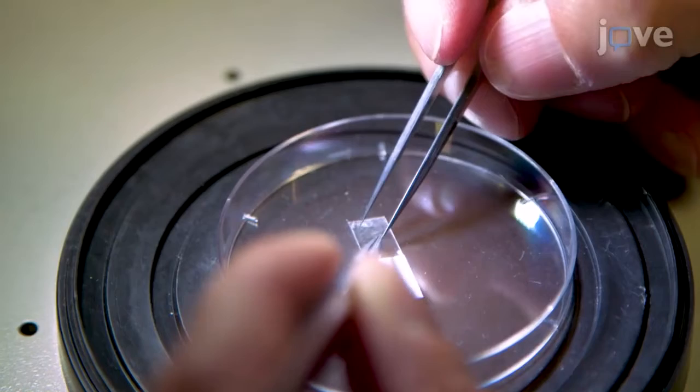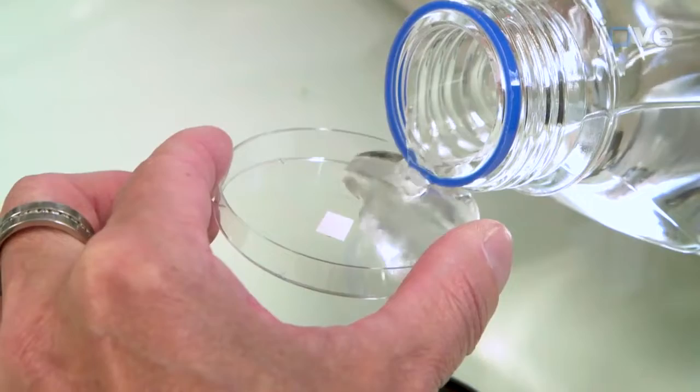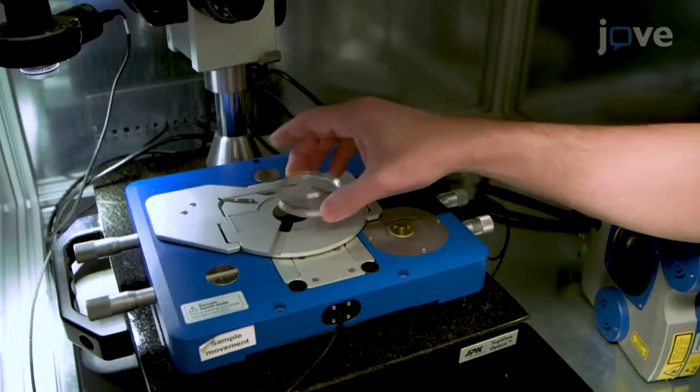The main advantages of this technique is that it is non-invasive, it is relatively rapid, and it does not require treatment, so it can be directly applied to living samples.